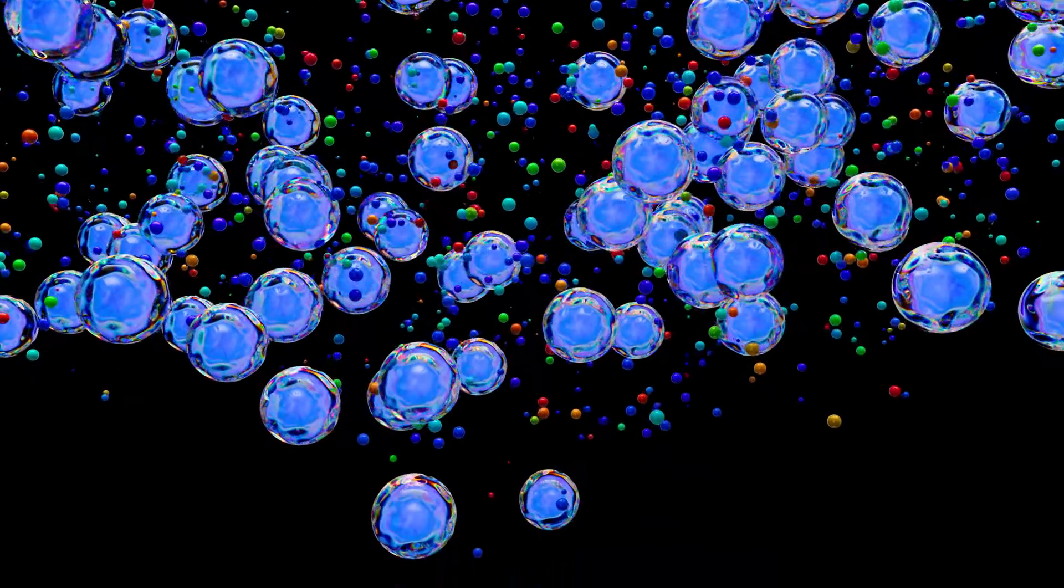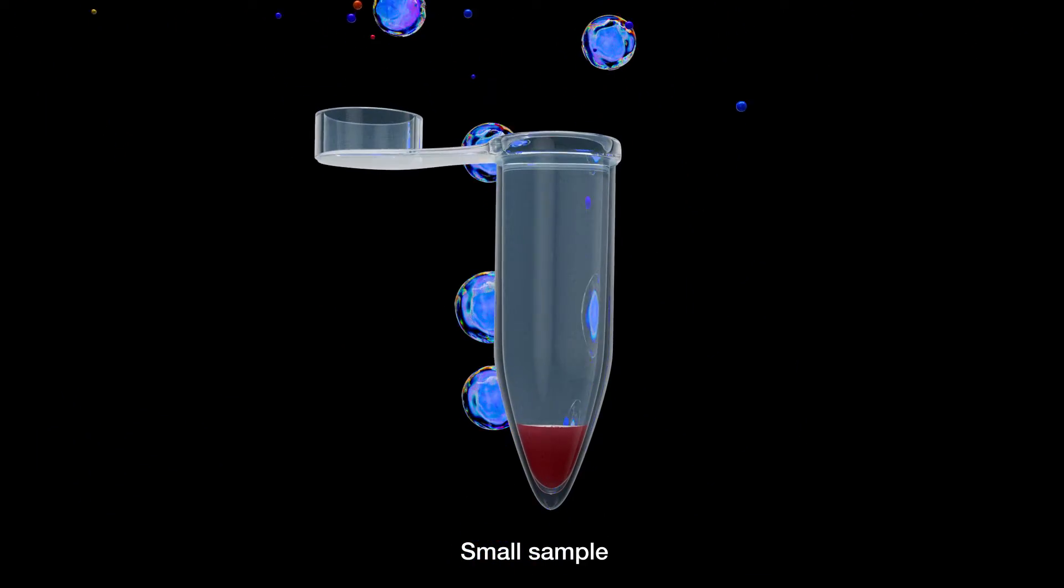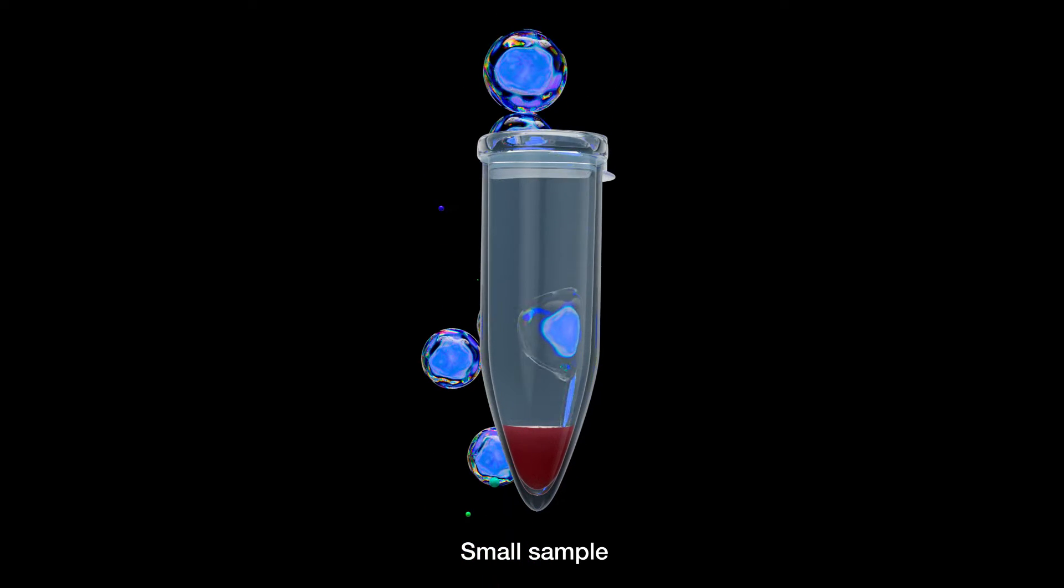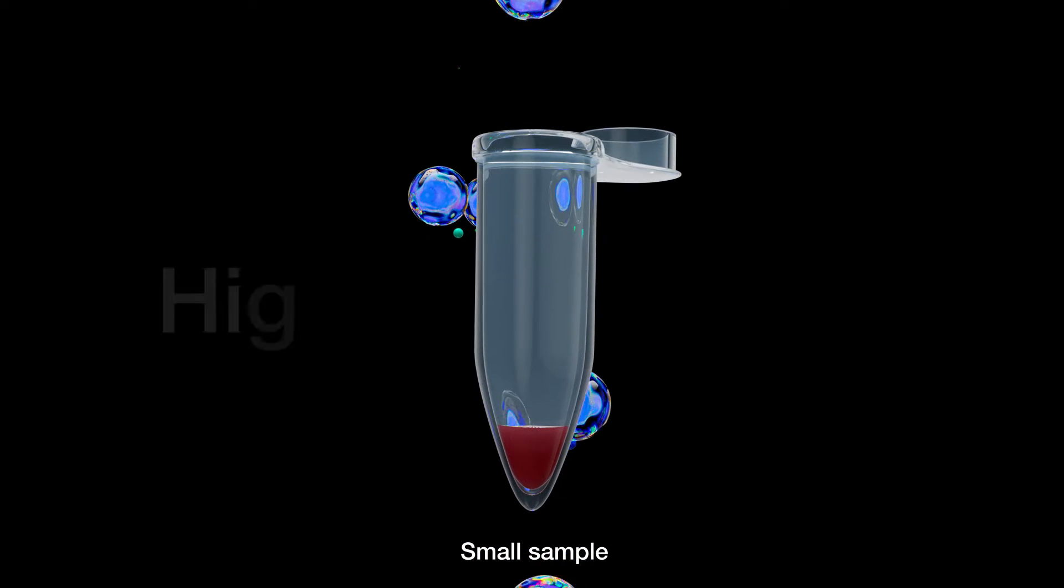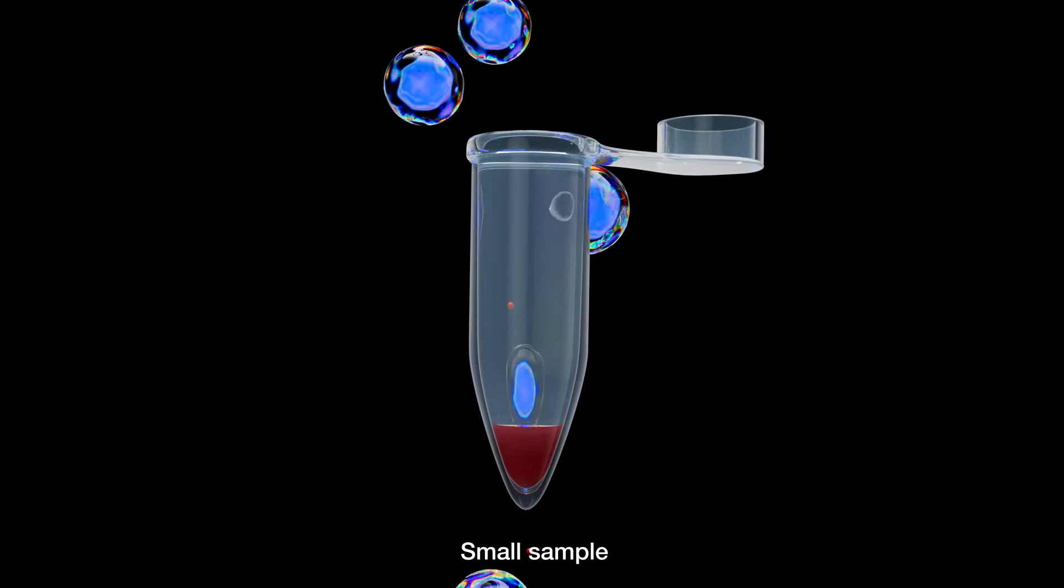For example, you receive a small sample of material that is hard to obtain. How do you make it go a long way? Spectral flow cytometry enables you to get high dimensional data, even from precious samples that are limited in size.